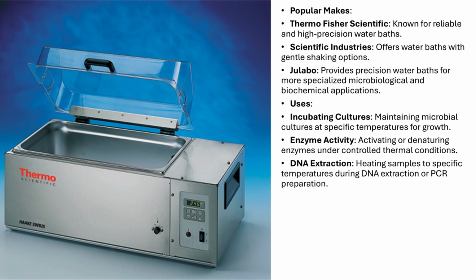Popular makes. Brands like Thermo Fisher Scientific, Scientific Industries, and Julabo are well known for their reliable and high-precision water baths, offering options with gentle shaking and digital controls for more specialized applications in microbiology.